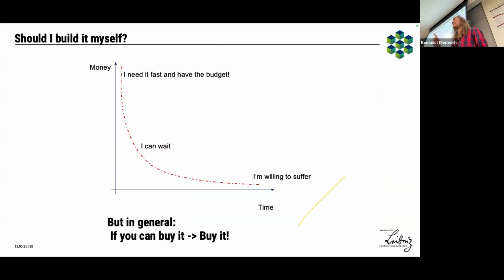But if I do that in a context of research, and let's say I spend 2 months of writing code and designing the PCB, then I'm worth €10,000 just in salary. So then this advantage doesn't really pay off anymore. I mean, once people use it, then of course open source is nice. But there's this balance between, okay, is it really cheap? Or do I need to spend actually quite a lot of time to get it running?